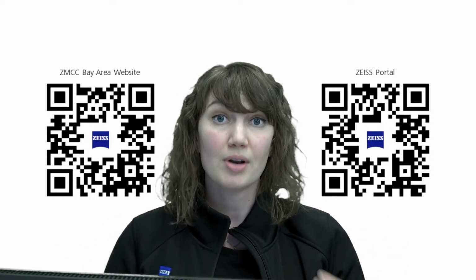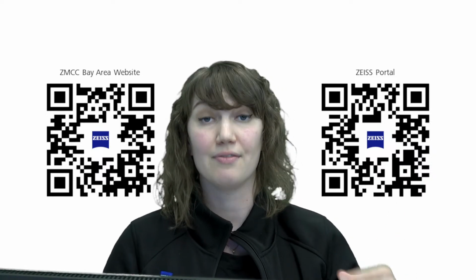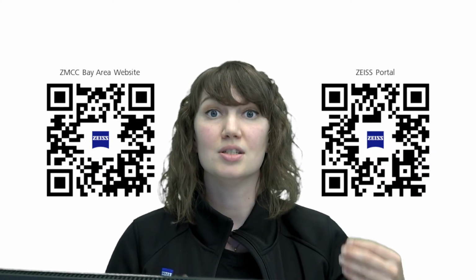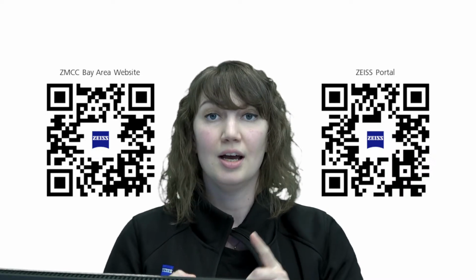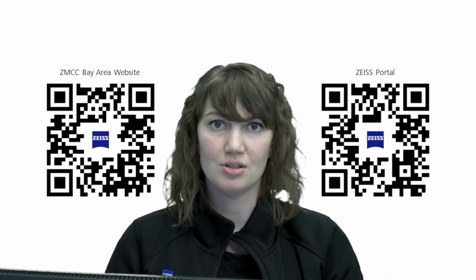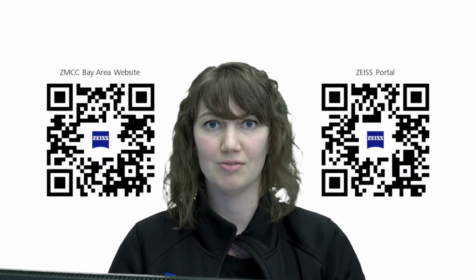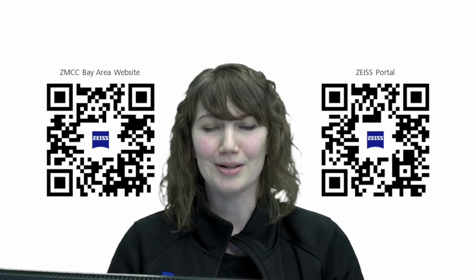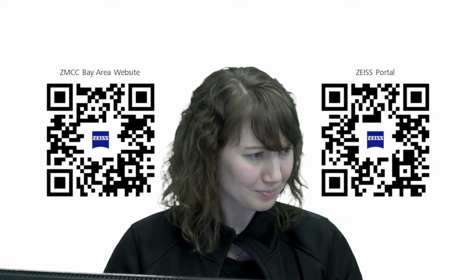If you are interested in it and you don't have the Airyscan detector, I believe the systems that are currently capable of having that detector added and running the current software, which you do need ZEN Blue for, are the LSM-800, the LSM-900, and the 980. If they don't have an Airyscan detector currently, you would have to buy that hardware, and then it is just the software and making sure we have the compatible objective, because it needs to be an FCS capable objective, basically the highest optical quality and QC possible. Let me know if that answered your question or if you have any more specifics on that.